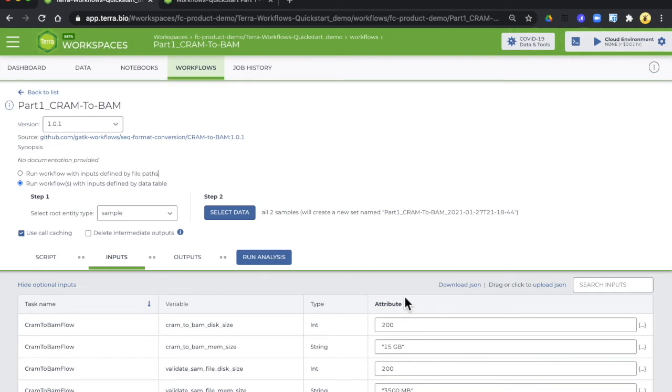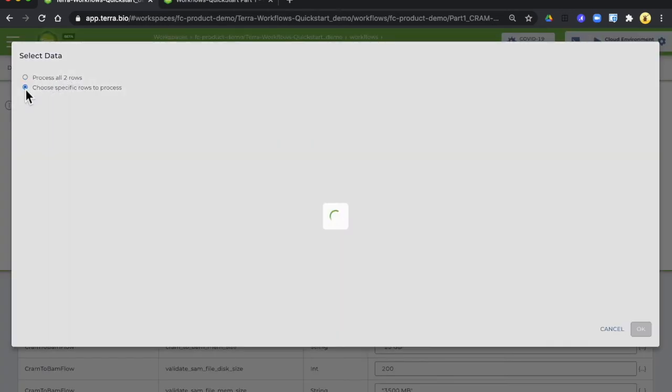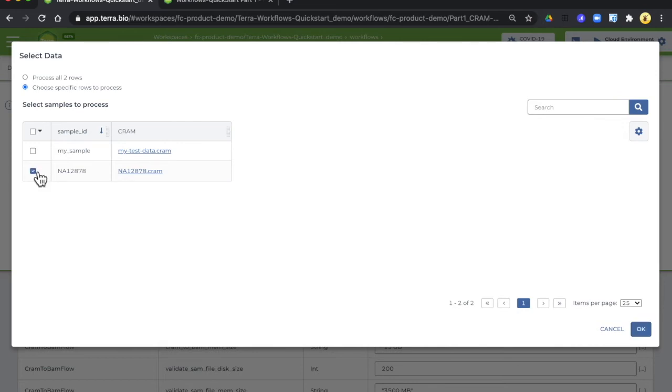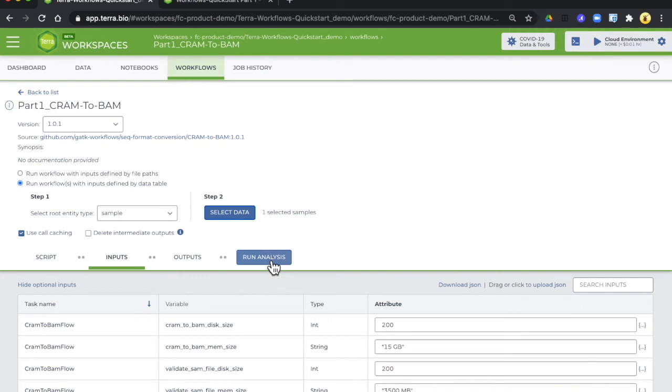First we're going to select data and for this exercise you only need to run on one sample. I suggest starting with the NA12878 sample so you just select it right here and hit the OK button. Notice that the run analysis button is blue and you are ready to go. To start the analysis you click the run analysis button.